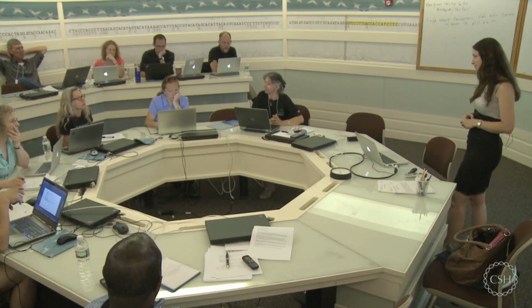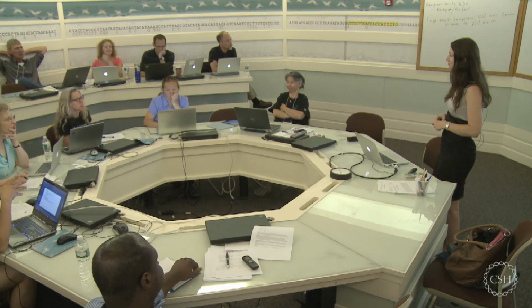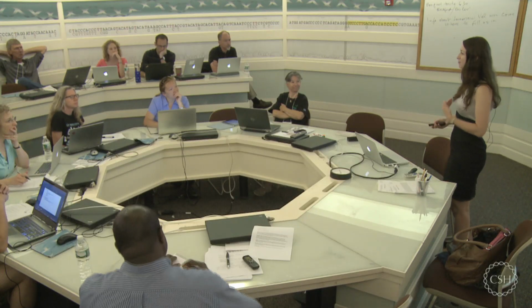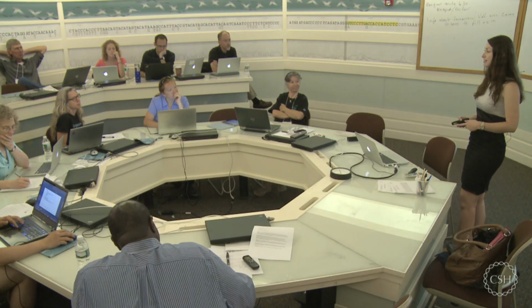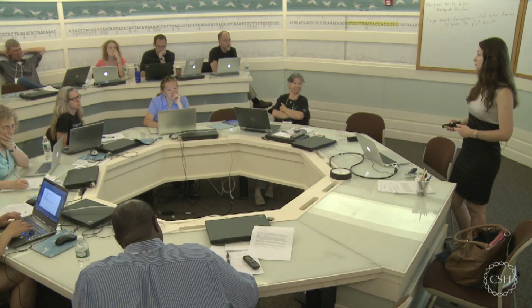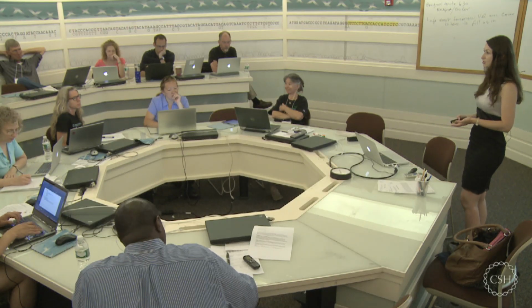So if you're going the 2-step way, what do you recommend? Random primers? I mean, we use random primers. Yeah, so again, it depends on your application. I personally use random primers because I'm working on non-coding RNAs, so I want everything to be amplified. So random hexamers, of course, amplify your rRNAs, your tRNAs, everything which doesn't have a poly-A tail, whereas oligo-dT only amplifies things which have a poly-A tail.